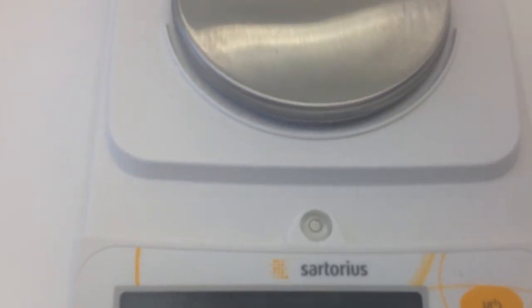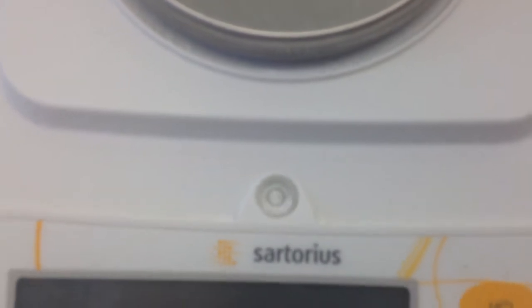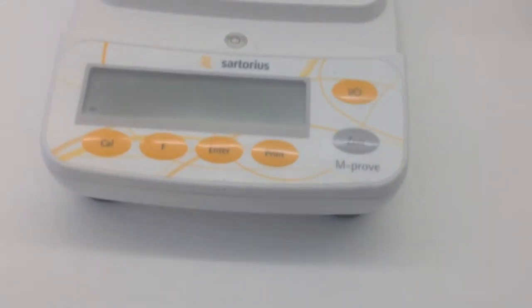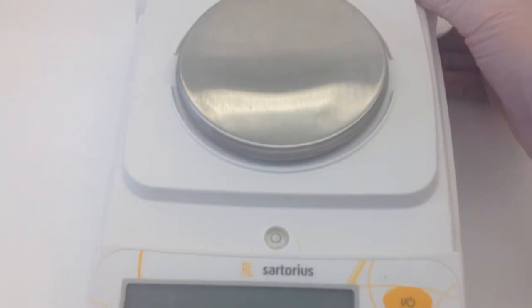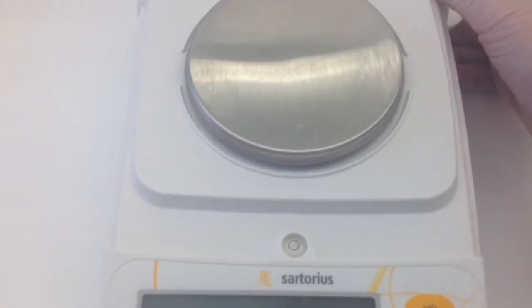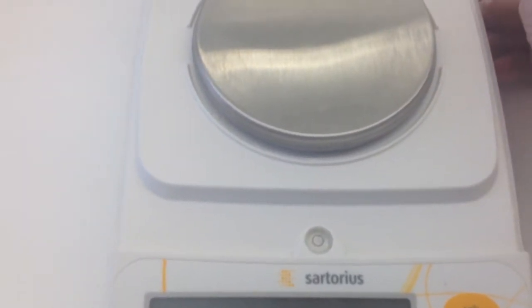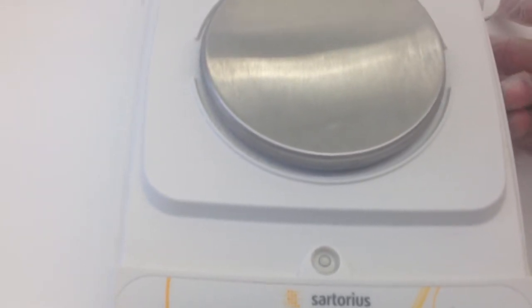If I just lift this up you'll be able to see it easier. You can actually see right now that there's a little air bubble and it's up in the top right-hand corner on the spirit level. We want to make sure that that leveling bubble is actually going to be in the center of the black circle. There are feet on the bottom of the balance. Because this bubble is in the top right-hand corner, I have to use the back right-hand leg on the balance in order to get the bubble where it needs to be, so I'm just going to rotate this foot a little bit.